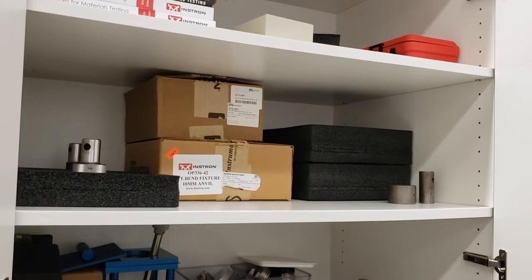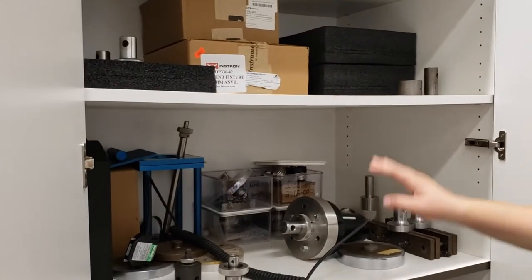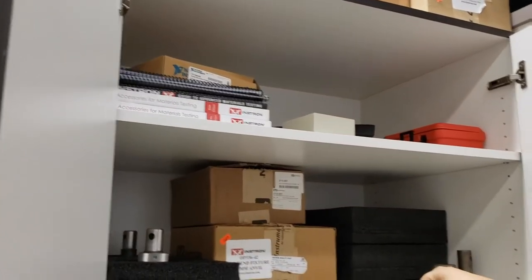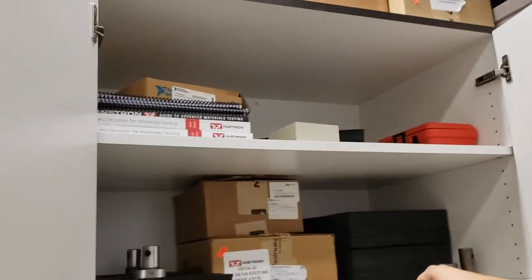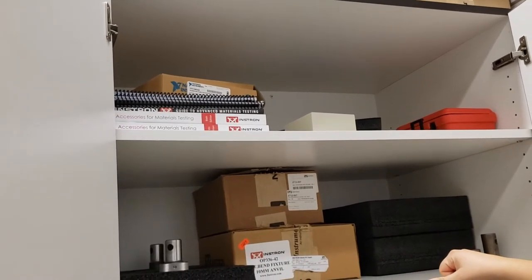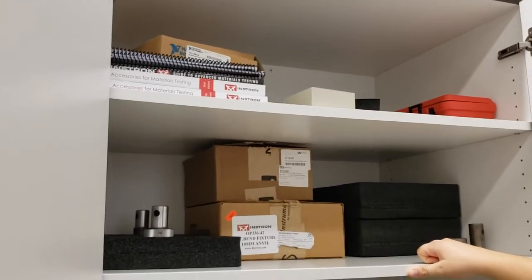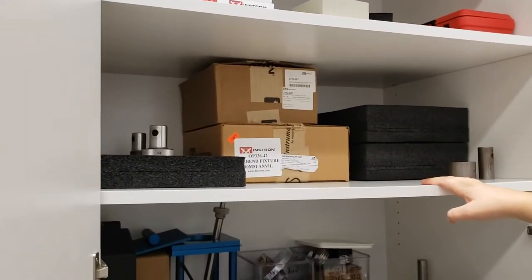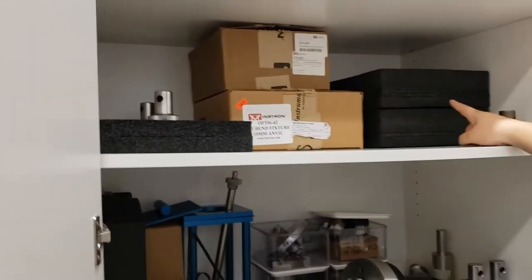This is the white cabinet located just behind the Instron. We have several shelves here. The two in the middle, right about head height and shoulder height, are going to be the most useful. The top shelf has manuals as well as a catalog of accessories that Instron sells. If your group is looking for something that is ASTM rated or a very common testing method, you can purchase accessories from Instron. If interested in purchasing accessories for a project and you don't want to own them forever, talk to the lab manager — we may be able to work out a deal splitting the payment on a new accessory.